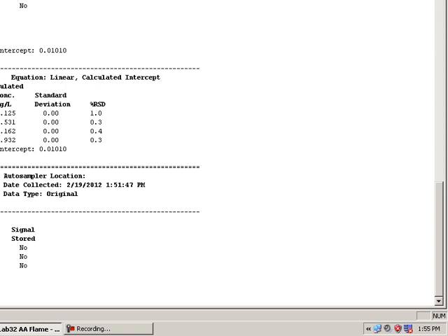The mean is 3.359 parts per million, with a standard deviation of those three analyses of 0.007 parts per million. So that's pretty good reproducibility. Again, we'd probably have to do that several times to get a true standard deviation. That's actually a standard deviation within the particular analysis.